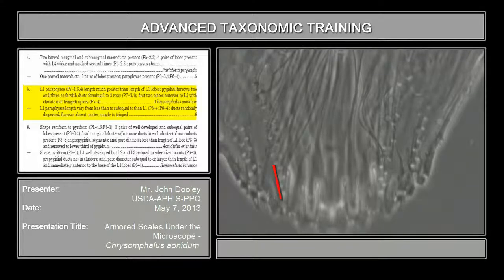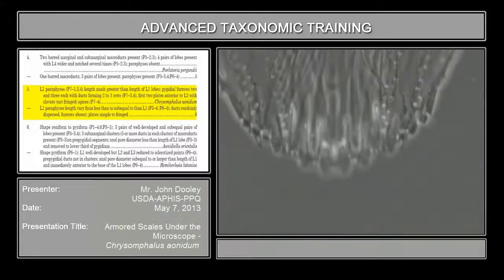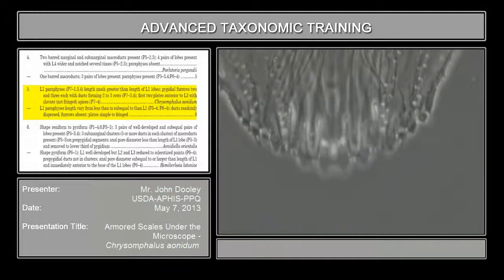It's usually going to be this row and this row. In this case it's only two, so it's usually going to be aonidium, especially with that duct arrangement — pre-pygidial duct arrangement. But if they have three rows and you notice that, then it may be a different species. So this is something else you have to recognize.